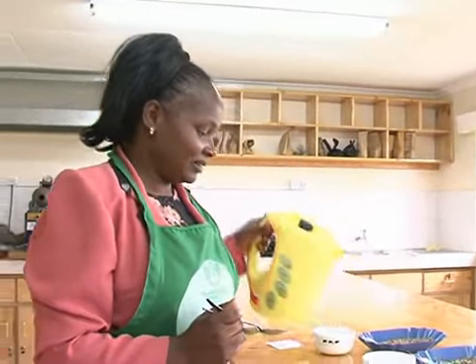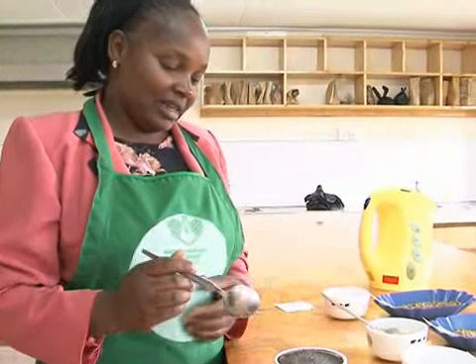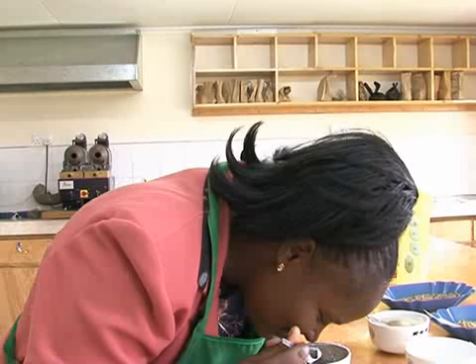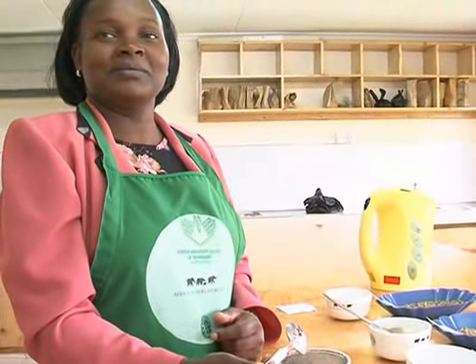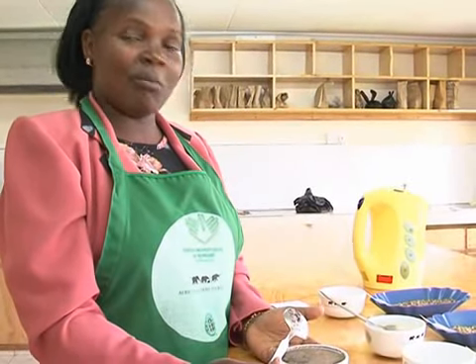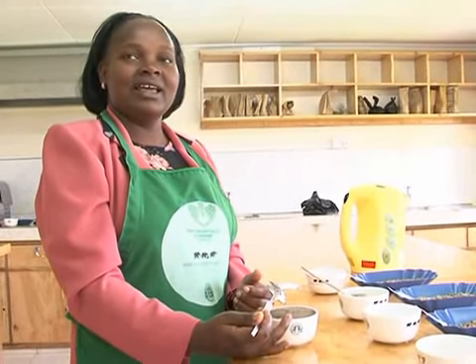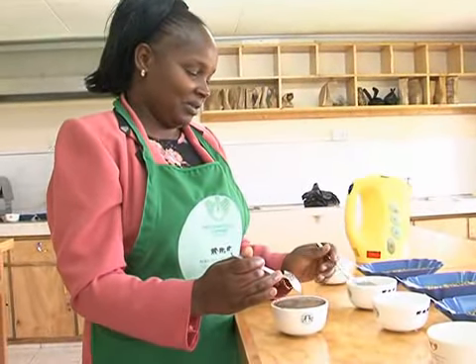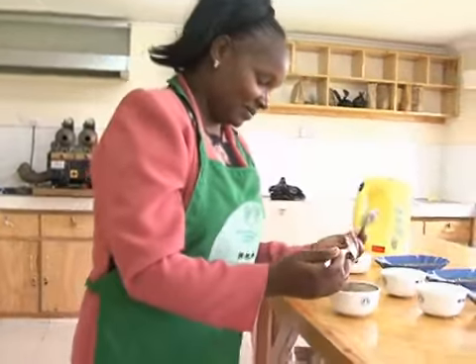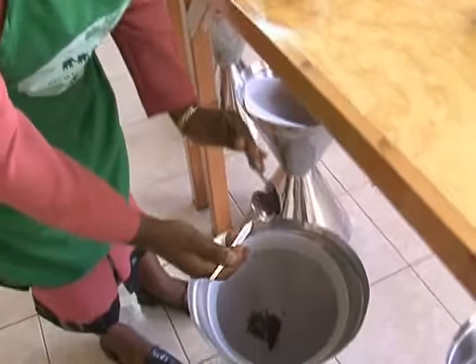Then after 4 minutes, you break the crust. And when you are breaking the crust, you are supposed to smell that coffee. And you are ready to tell the aroma of that coffee. So what we get from this cup, we get the aroma, the body, and the acidity. The aroma, you get it through your nose, and the acidity and the body, you get it through your tongue, the taste buds. So from here, you remove this crust, and use the spitting cans.